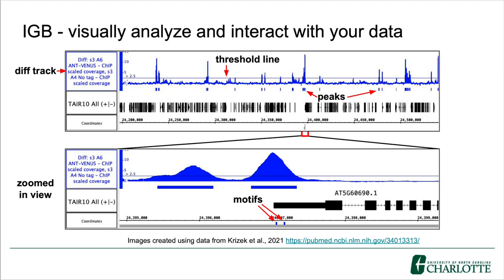Once your data is loaded into IGB, one of the main use cases is to visually analyze your data. This can be important for a number of reasons — for example, as a sanity check that the data appear as you would expect them, or maybe you want to investigate a region or gene of interest in detail, viewing several types of data layered together.